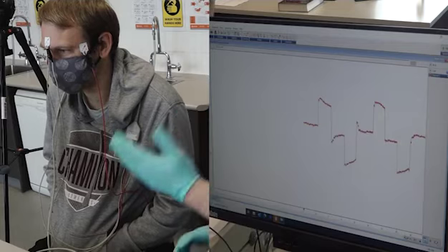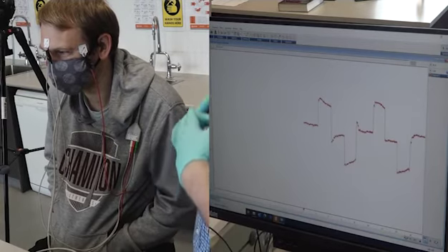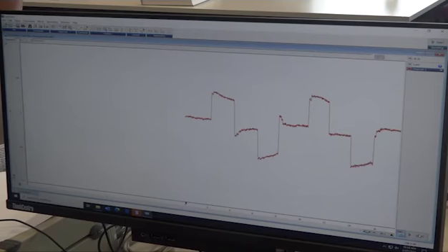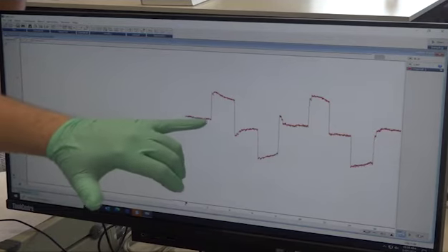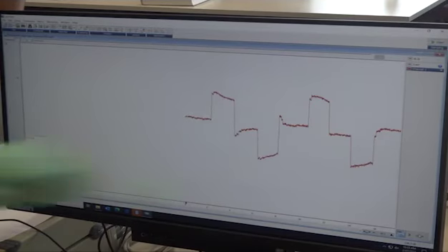As you can see here on the screen, when our participant is looking straight ahead, both electrodes are equally picking up the potential that runs through the center of the eye. That is when the signal is somewhat middling.